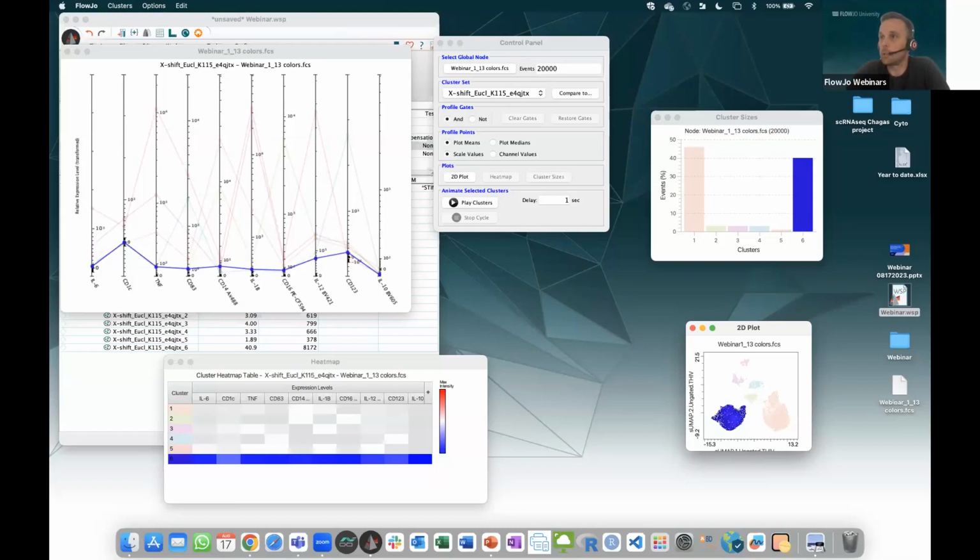For clustering, should we ignore forward scatter and side scatter parameters? Yes, mostly yes. My answer to that is yes. I know some really few people, for specific biology questions, include them, but 99.9% of the time, ignore forward scatter and side scatter.